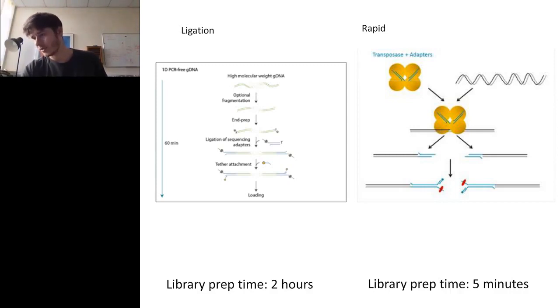The motor I talked about earlier when I was describing the flow cell. The motor protein sits on the end of the adapter, which is ligated onto the amplicons, which means that when you put them into the flow cell, they are able to interact with the pore and initiate that sequencing read.